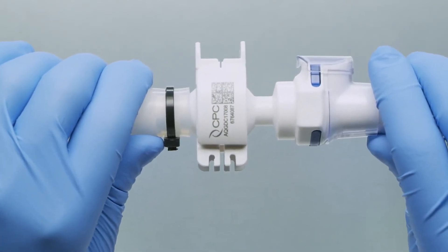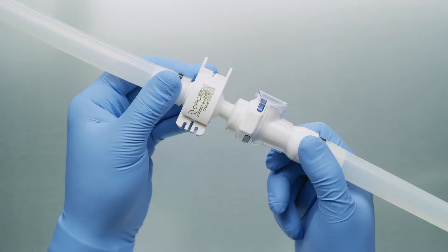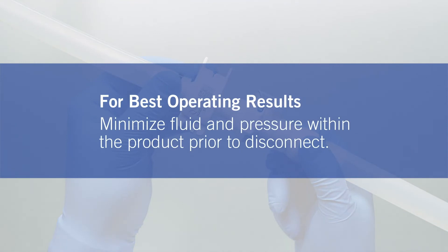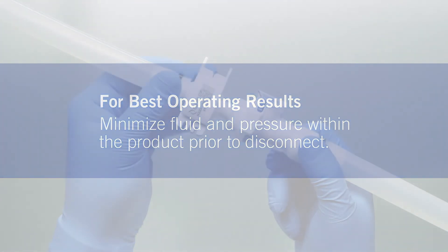When the process is finished, prepare for the disconnecting process. Ensure there is no liquid or pressure in your tubing and that the AceptiQuik G disconnect is isolated with pinch clamps.